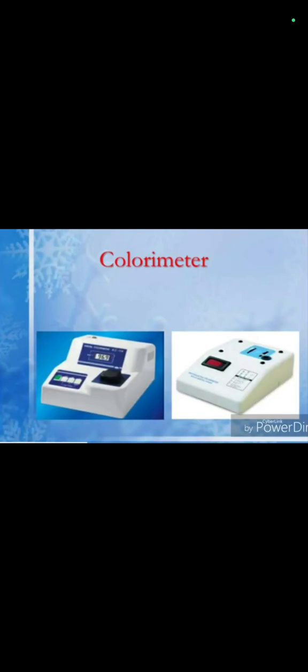In today's class, we are going to discuss about colorimeter. So what is colorimeter? Colori indicates color and meter indicates to measure. It means colorimeter is an instrument which is used to measure the color intensity of any reagent. And on the screen we can see the image of a colorimeter.